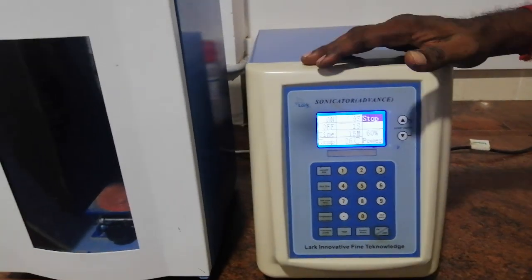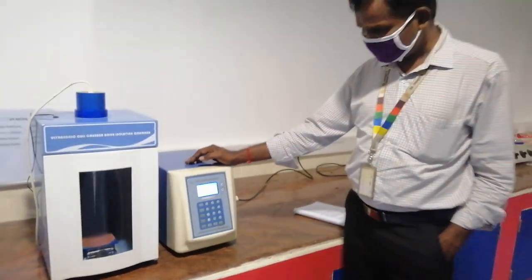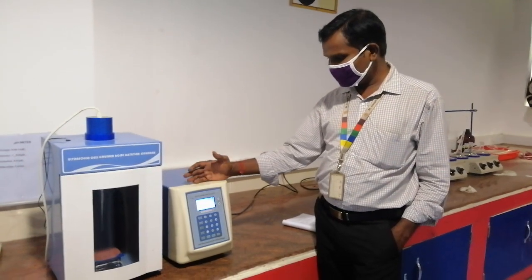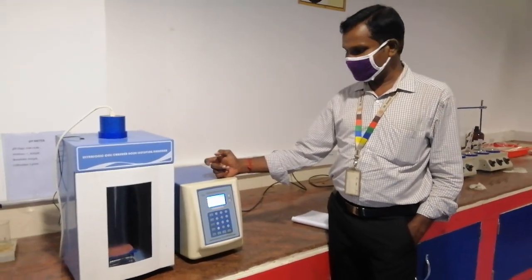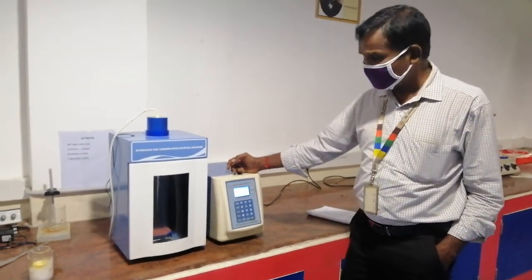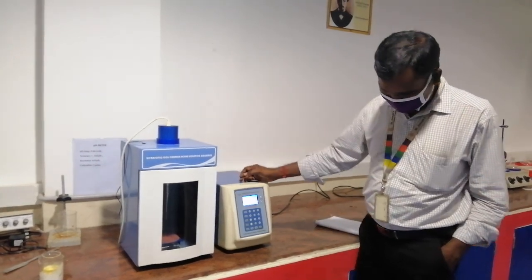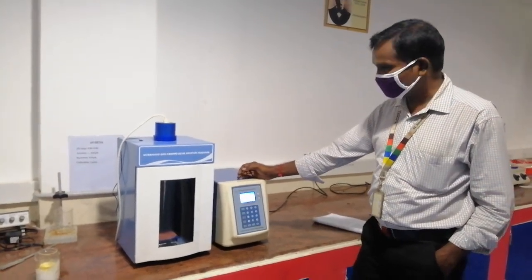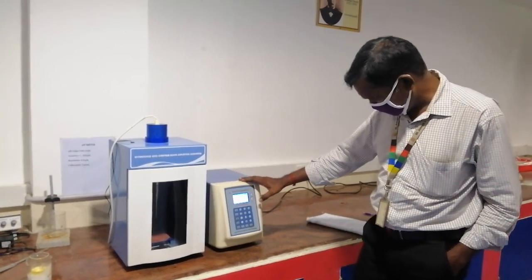One of the major disadvantages of ultrasonication for cell destruction is that when your cells are exposed to the high frequency ultrasonic waves, the temperature of your cell suspension will increase. So it is important to provide a cooling system and decrease the time of exposure. Therefore, we can avoid the denaturation of the product.